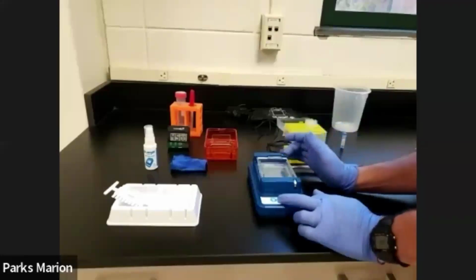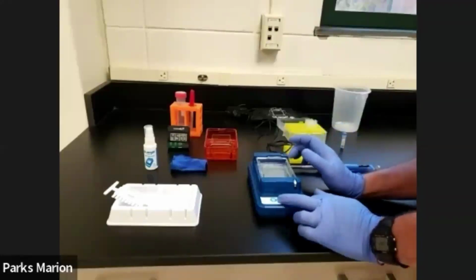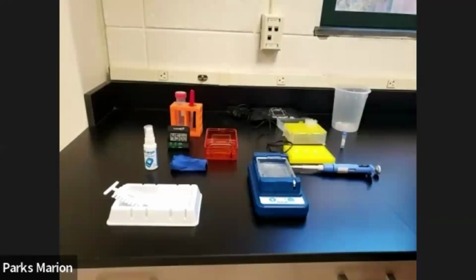If we do notice any bubbles, we can just gently tap on the buffer chamber to release those bubbles and help them come to the surface. Next, we're going to find our micropipette, make sure that it's set for 12 microliters. And we're going to begin by filling our wells following the instructions and the diagram found in the lab protocol.